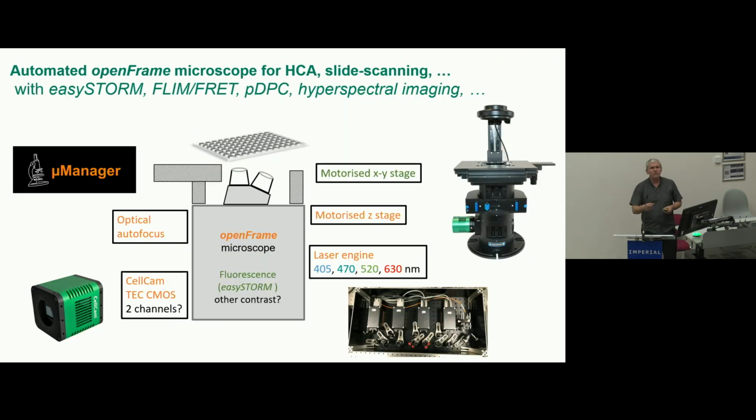But having a single field of view is not sufficient, particularly if you are in the area of medical discovery or drug development, and you need to screen a lot of different molecules. Usually pharma works in 96, 384, or even 1536 well format, where every well has a different biological sample and you are testing different conditions.